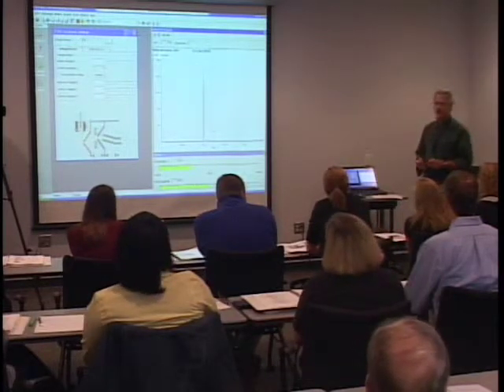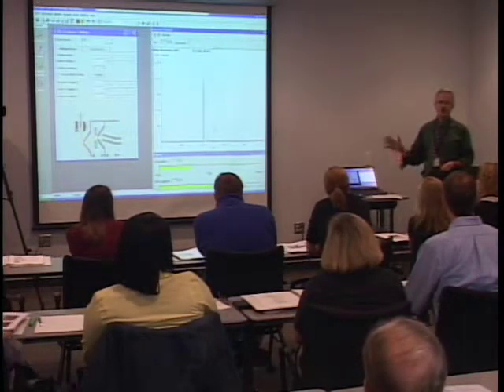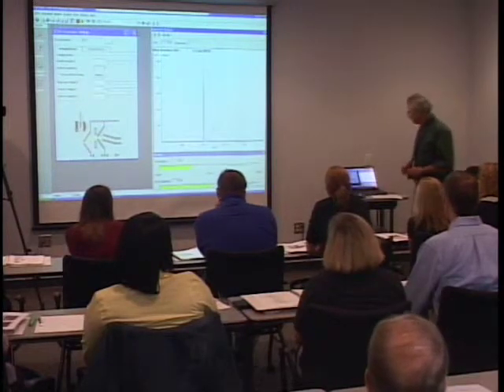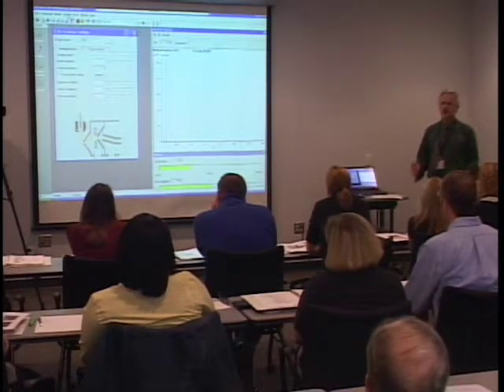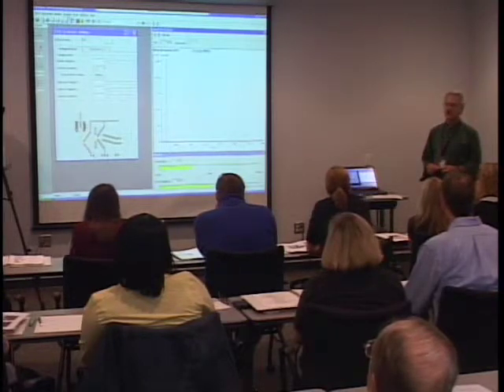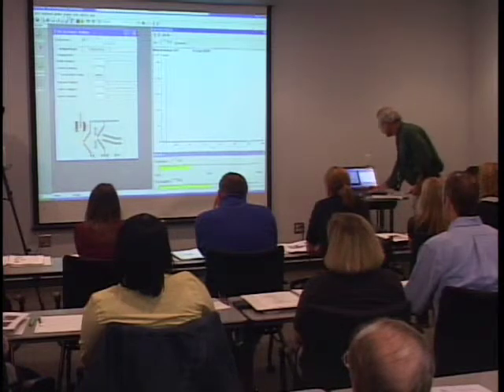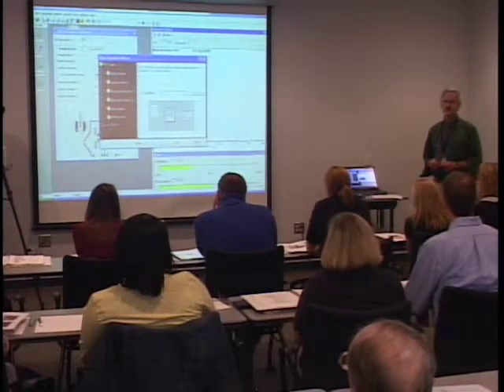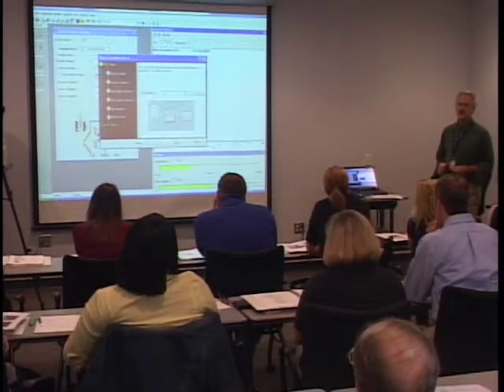We'll do one more thing and then go into the lab — I'm just going to show you how to make a measurement. We don't have any sample in front of it, so we're just going to measure the background. I'll leave the peaks voltage at 100 so you can see these low mass peaks. We'll save them to a data file and then show you how to open the data file. To measure a sample, this software doesn't have an easy run button, so we're going to use the single acquisition wizard — it just asks you for the name of the data file, confirms what masses you want to measure, and how fast.